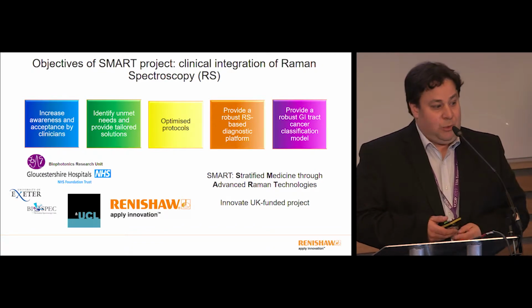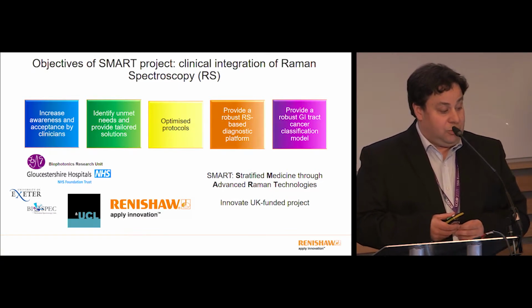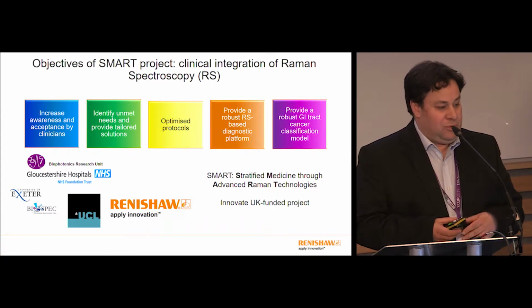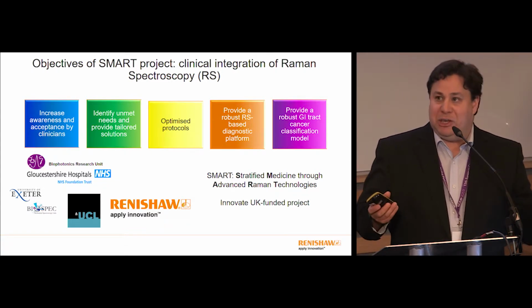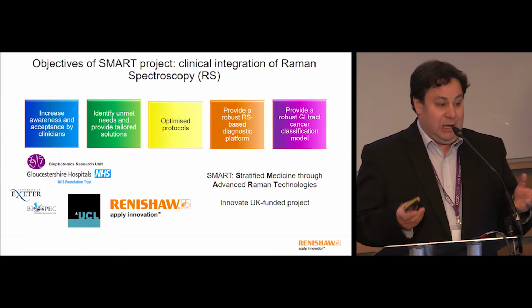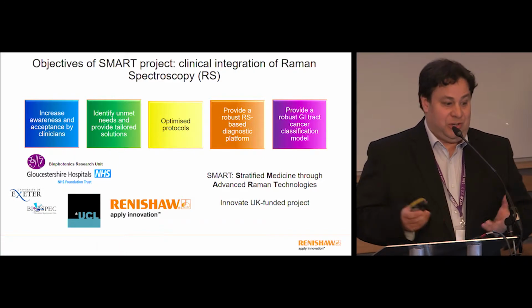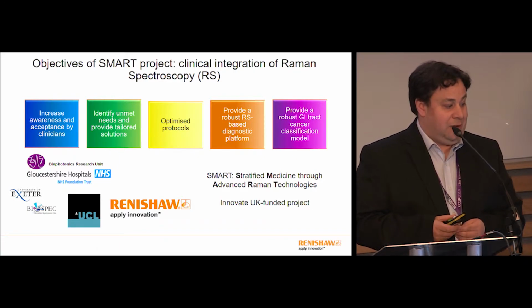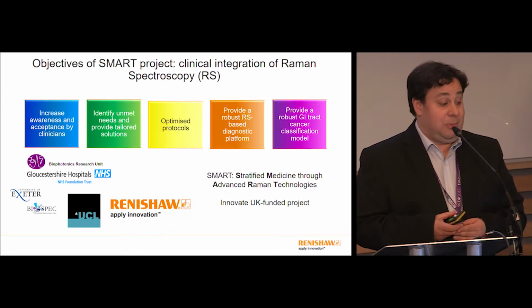Just going to briefly talk about the 2-year project that we collaborated on with Gloucester Royal Hospital, Exeter, and UCL. Essentially we wanted to promote Raman spectroscopy. It's a very new technique in the bio field, and we wanted to meet the challenge of introducing Raman spectroscopy here. Primarily that means increasing awareness among pathologists and clinicians about our technique.